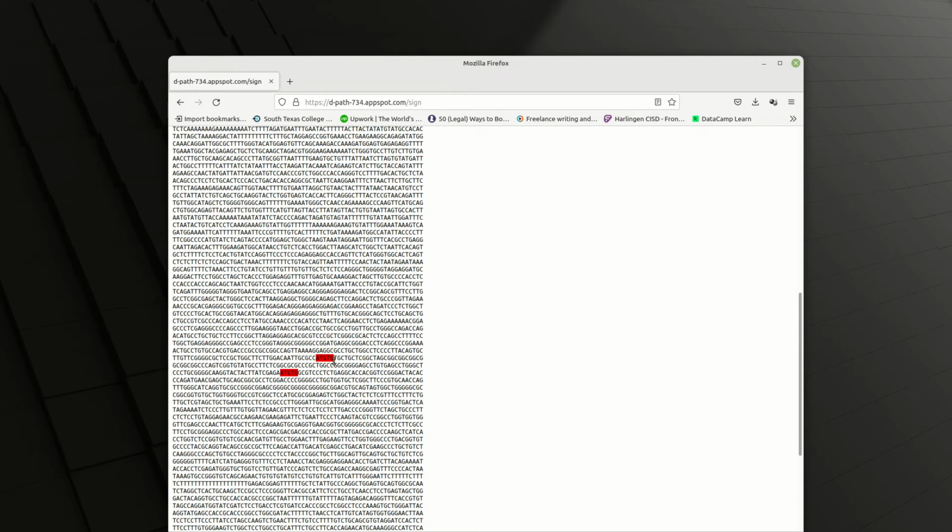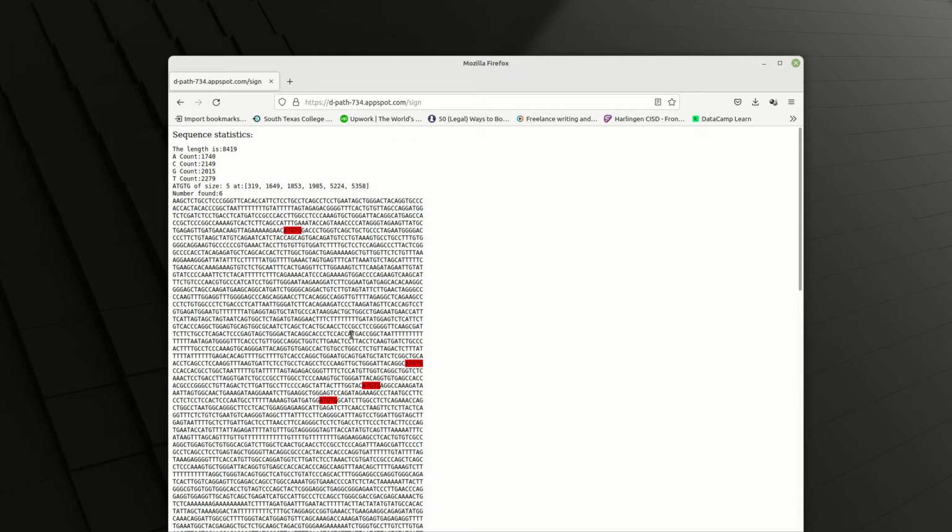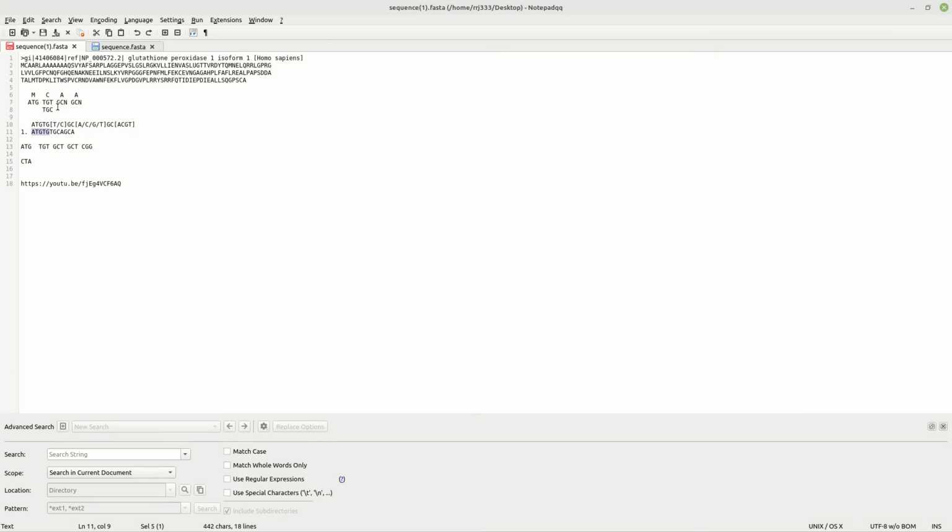Alright, but let's just go ahead and check it anyhow. I mean, no use me telling you the wrong thing. What would the next letters be? It would be a TG. Why don't we even try this? Why don't we go a little further? ATGTG, and I think it was an A. Let's try that one.